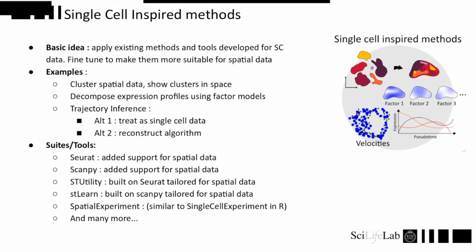We also have ST Utility, which is built on top of Seurat, but very tailored for spatial data. I should actually say here, tailored for Visium or ST data. It was developed by two people in our group, since they work so extensively with just ST and Visium data. Then we have STLearn, which is built on top of Scanpy rather than Seurat, and again tailored for certain forms of spatial data. Also very recently, and with that I mean yesterday, some people submitted a manuscript to bioRxiv where they presented this new library called SpatialExperiment, which is supposed to be very similar to the SingleCellExperiment library and ecosystem in R. I have not had the time to check that out, but at least it exists.